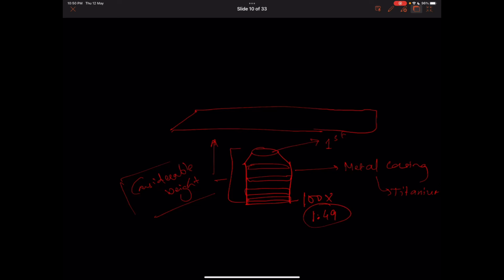These objectives are usually offered by Nikon, and are used for single molecule imaging, or for super resolution microscopy, which is done at TIRF, like total internal reflection microscopy, all those things. Okay, so in that case, what you would want to do is basically take this objective up towards the stage so that you can focus your sample.